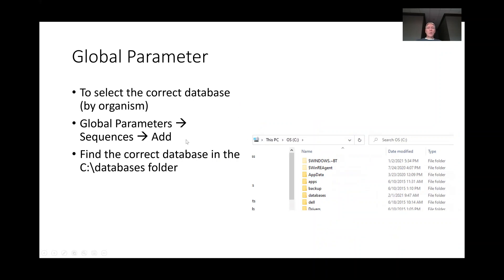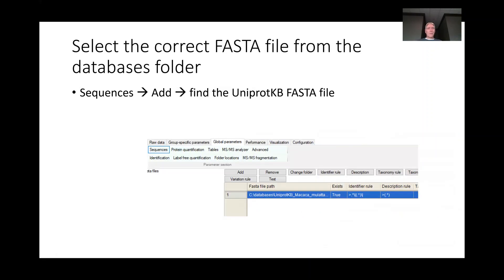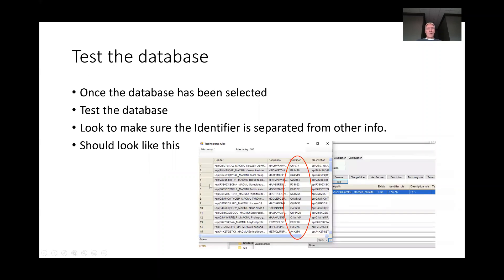We need the global parameter. Under global parameters, we need to go find the FASTA file for the organism that we're using. If you're doing human or mouse or whatever, then you need to get that FASTA file in there, and then I like to check it. So here's my UniProt FASTA file for my baboon experiment, and then I can check that and make sure all the metadata is going into the appropriate columns here.